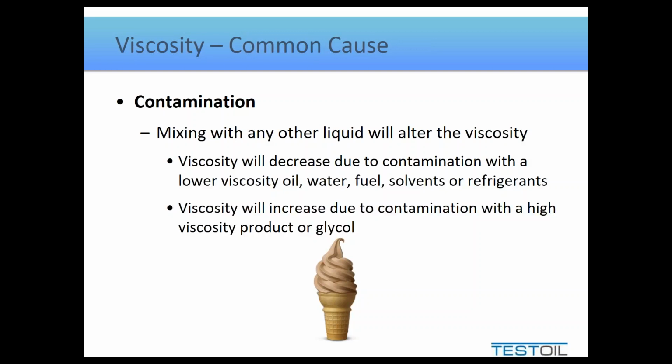On the other hand, viscosity can go up if you mix it with something with a higher viscosity, like a thicker oil. But also within this list is glycol. And this tends to raise a few questions. People wonder why, if water has a lower viscosity than oil, how does it depress the viscosity? But glycol, which is also a lower viscosity than oil, causes it to increase.